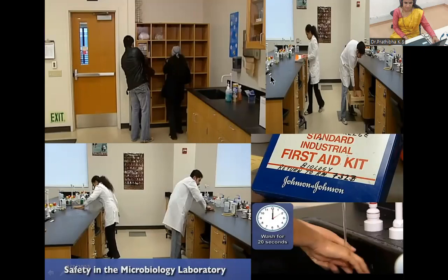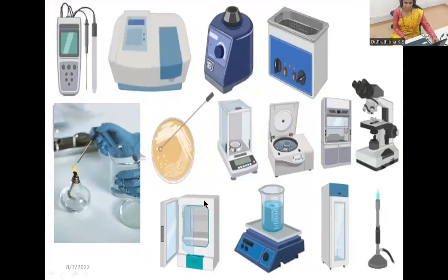And please make sure in a microbiology laboratory to keep first aid kits. Here you could see some of the instruments like pH meter, centrifuge, then here exposing the inoculation loop to the flame, incineration, and here you could see the streaking and the weighing balance, centrifuge, BOD incubator, and laminar airflow.